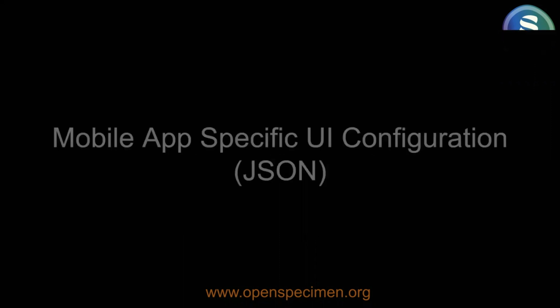Same thing for auditing. Again, another security concern: when you use the mobile app versus the web app, there's absolutely no difference. All the standard auditing that happens in the web app also happens in the mobile app, because finally the whole of OpenSpecimen works on APIs, so it does not really matter through what mechanism you are accessing the data or operating on OpenSpecimen. Everything gets audited the same way, so there is no difference.